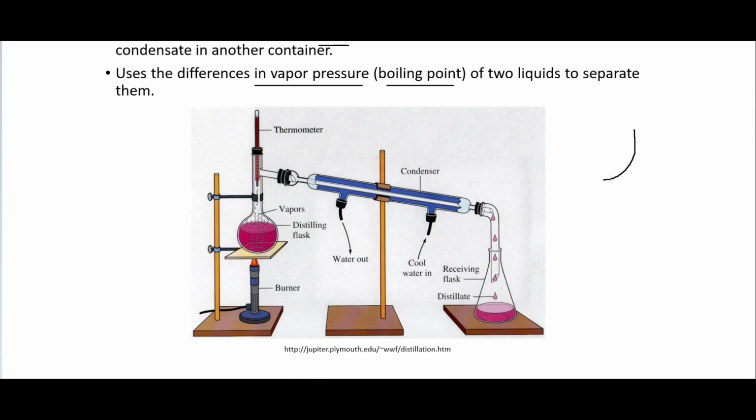And so this is what you will probably be using, especially if you are taking an organic chemistry class, where we are going to boil our solution right here. The vapor will move up.